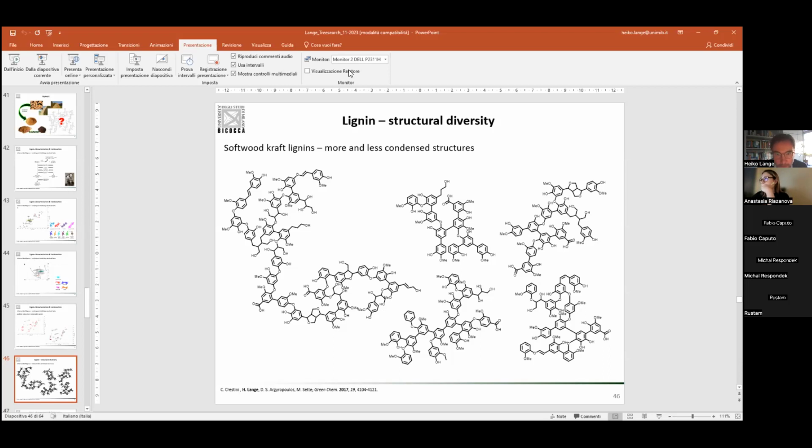Okay, so you take, for example, 100 grams of lignin and you throw it into acetone. You stir it for a certain amount of time, and then you filter off whatever is not soluble, and you start from there. Okay, yes.